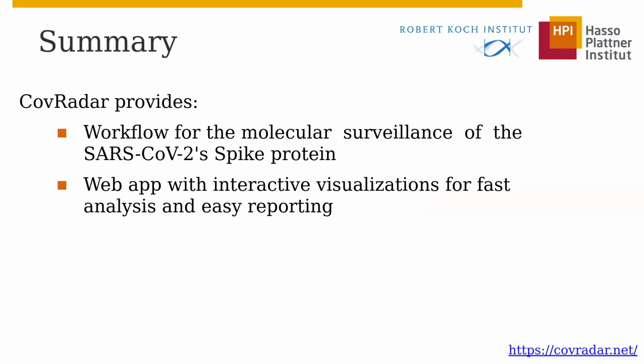I would like to end with a short summary. CovRadar is a tool for the molecular surveillance of the corona spike protein, and it consists of an analysis pipeline and an interactive web application you can find on covradar.net.